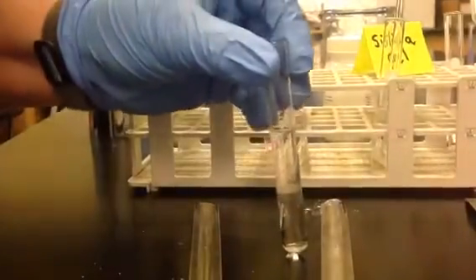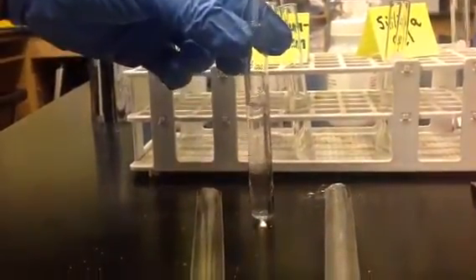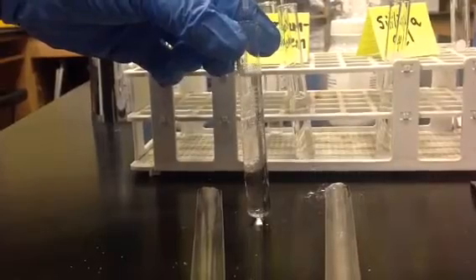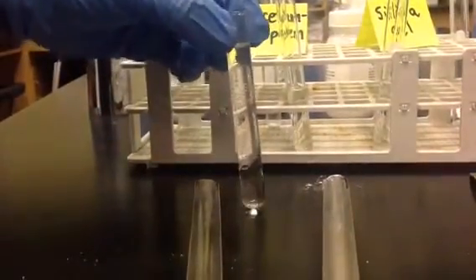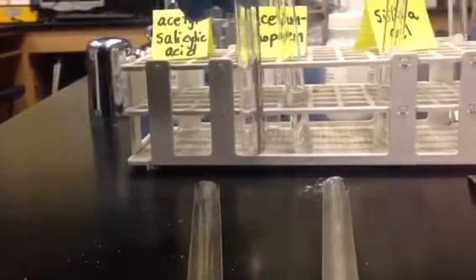So I'm going to add more water, and we need to look carefully to see, is it going to the bottom? Can you see that the drops are going to the bottom? And I'm out of room in my test tube.